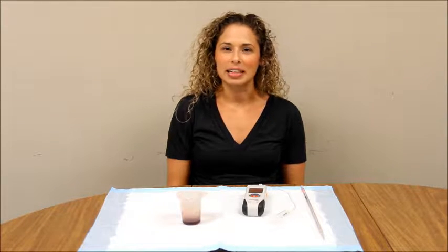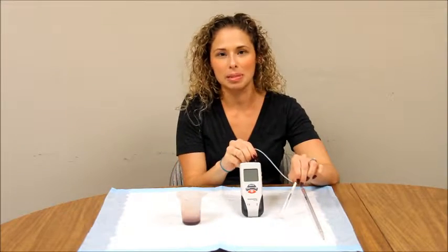Hi, this is Rachel from Bemetrica and this is our how-to video for the MLF assay using our new SC50 manometer.